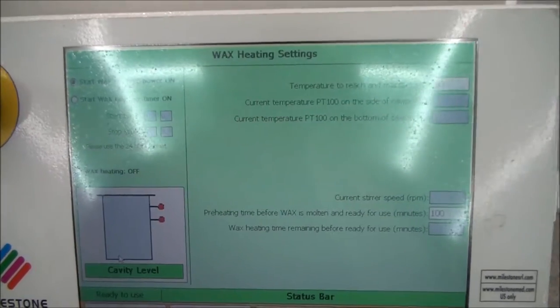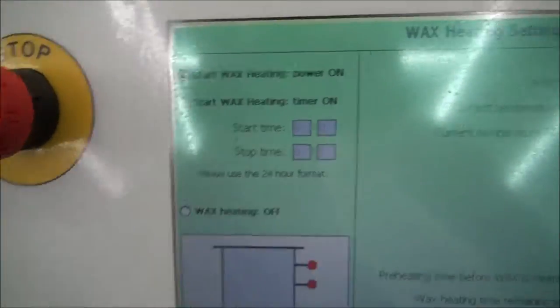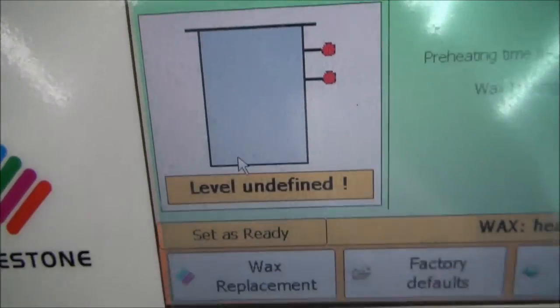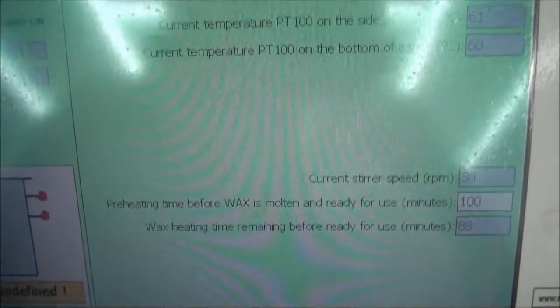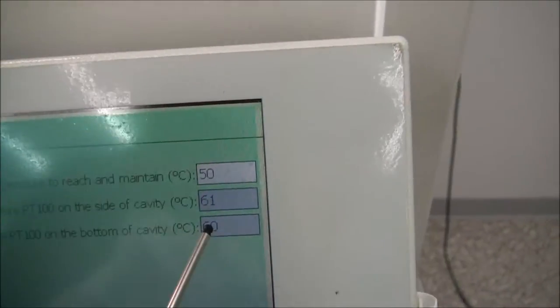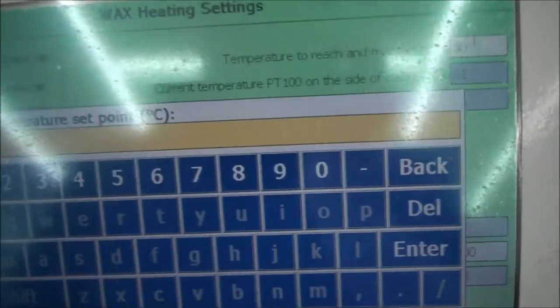From the wax heating settings page, you are able to adjust various settings related to the wax, such as timers, preheating time, temperatures, and stir speed. You are also able to manually set the wax as ready, but this may have a negative effect on any program that you may run.